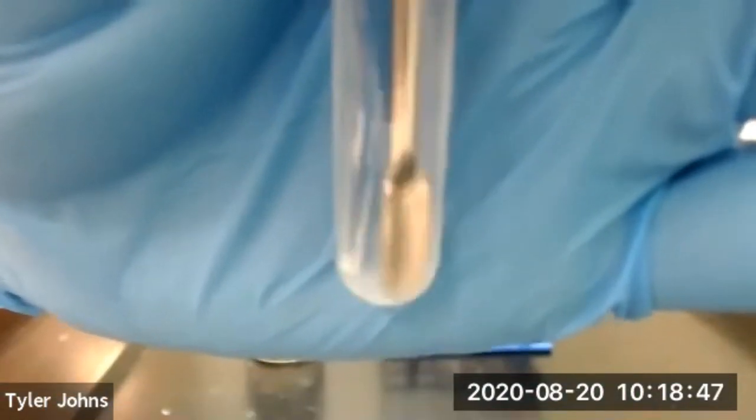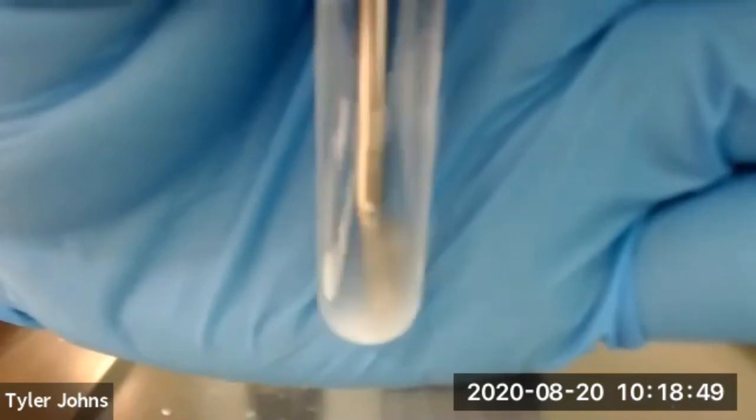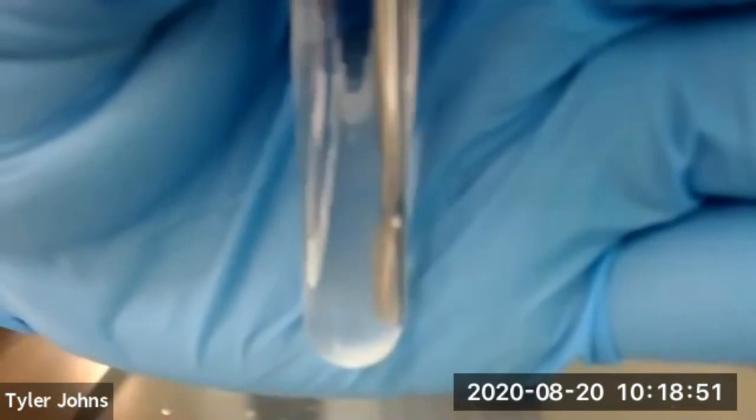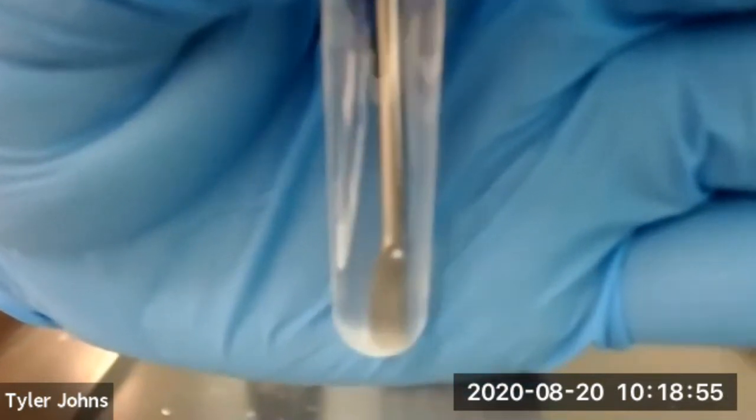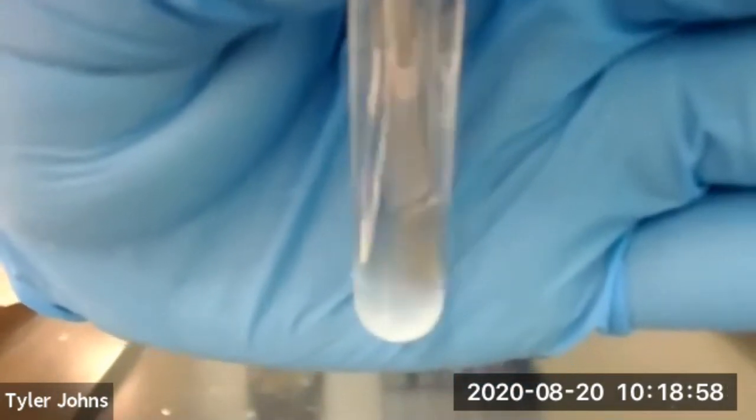Now you can see that our anhydrous sodium sulfate is free-flowing in our test tube and is not clumping. This indicates that our organic layer is completely dry.